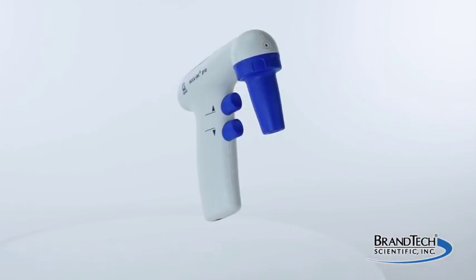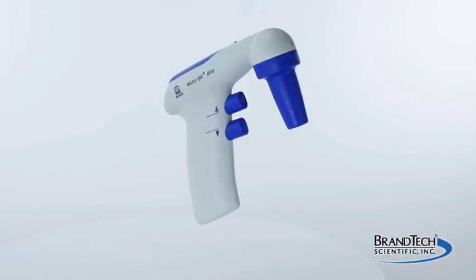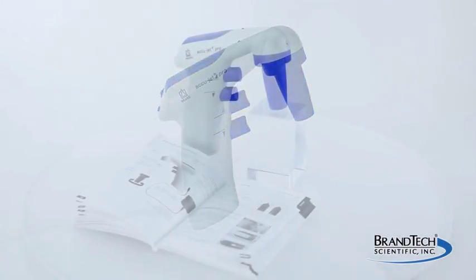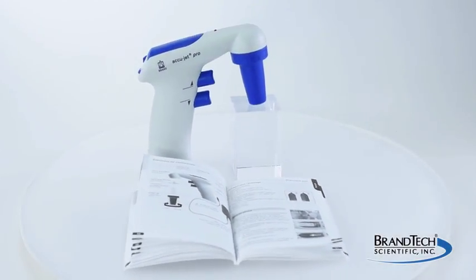This video demonstrates how to reset an AccuJet Pro pipette controller. It's intended as a general guide and not a substitute for your operating manual.